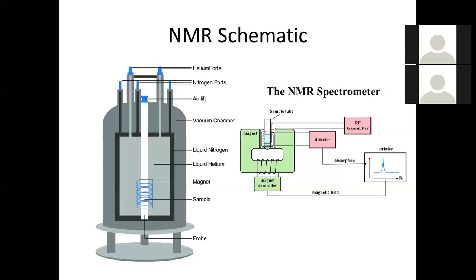So that's what makes these instruments so expensive. In order to maintain this magnetic field that was charged, which has a ton of energy stored in it, you have to keep it extremely cold. Otherwise, you run into a situation called a quench, where all of that energy stored in this material comes out at once, starts to evaporate all of that liquid helium, and then you have a really, really bad situation on your hands. Which is why these things have to be maintained quite well, and they're usually stored in basements. Also, that helium, as it boils, displaces the oxygen in the room, so people can suffocate and things like that.